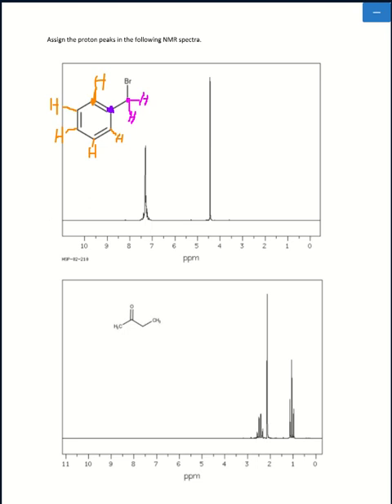Now then, with all the hydrogen spelled out or visible, for NMR, here's essentially what is done. You just start labeling the different unique environments of hydrogen. And if there's symmetry, well, we'll get into an example of symmetry. Let's take, for example, these 2 hydrogen right here.